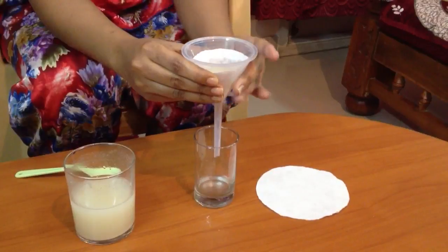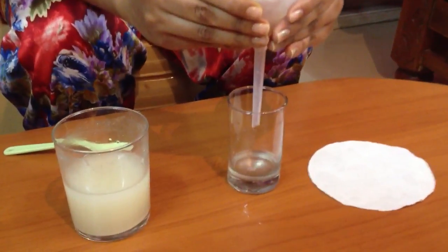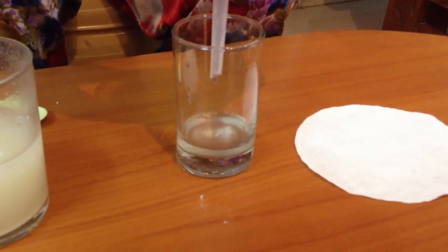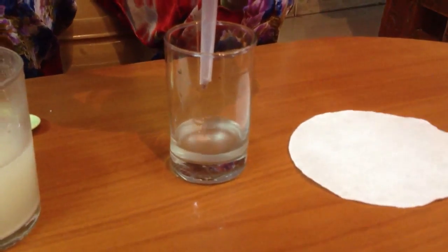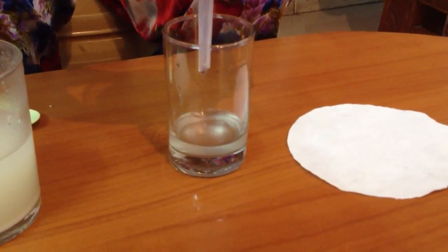Wait for some time and observe. What do you see? Clear water passes through the filter paper and is collected in the glass beaker.